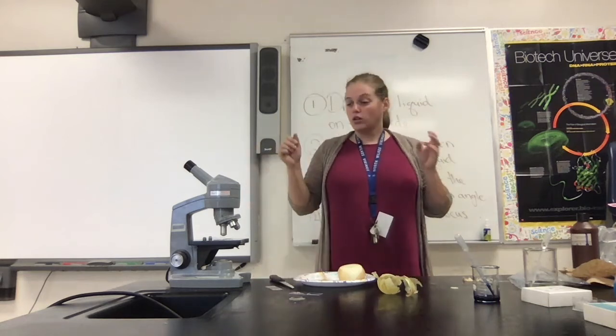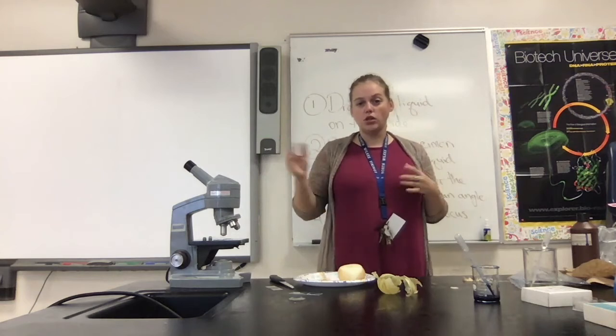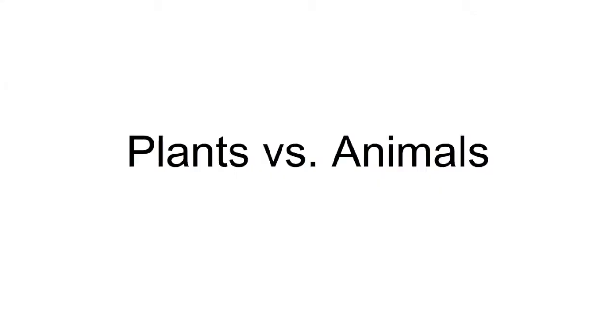So I'm going to go focus these microscopes on these cells. I'm going to take a few pictures of them from low to medium to high power, and then we'll talk about these different kinds of cells that you're seeing. Now that we've focused on these different plant and animal cells, let's talk about what we were able to see.